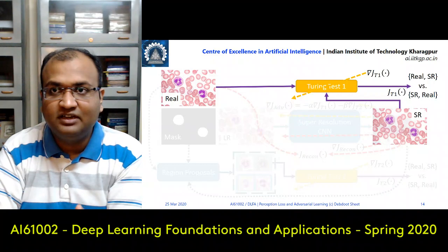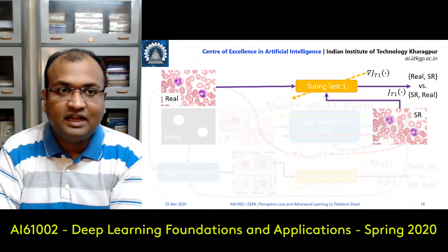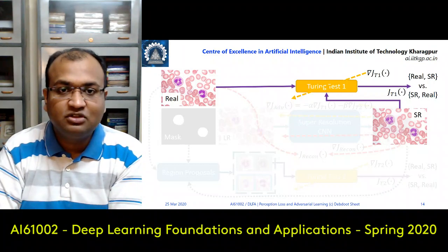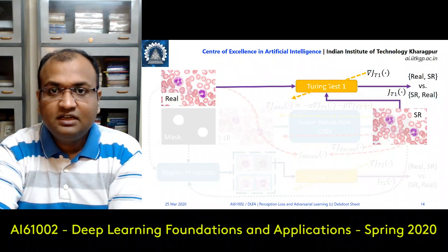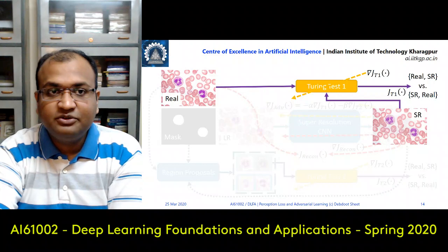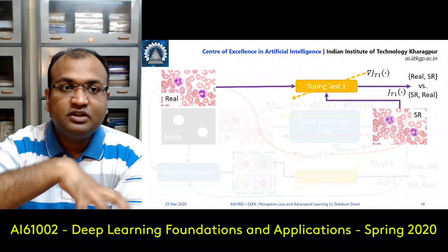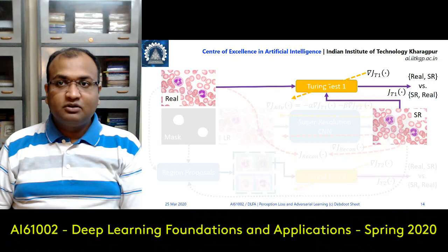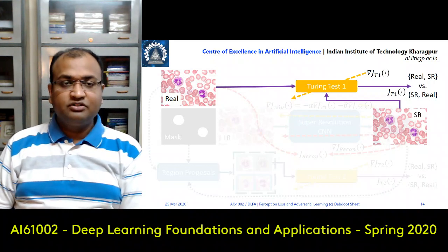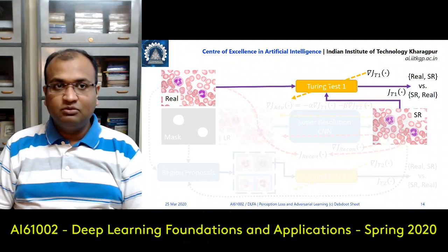This was the standard Turing test function which we studied till the last lecture, which had an example from ultrasound simulation. You have seen how that Turing test really works. But here also the problem is that this Turing test does not perform very well, because the majority of the constitution is still either the white background, made up of the plasma, or the RBCs, which are very flat in nature, and there are only a few WBCs, so it is not able to really emphasize the WBCs.